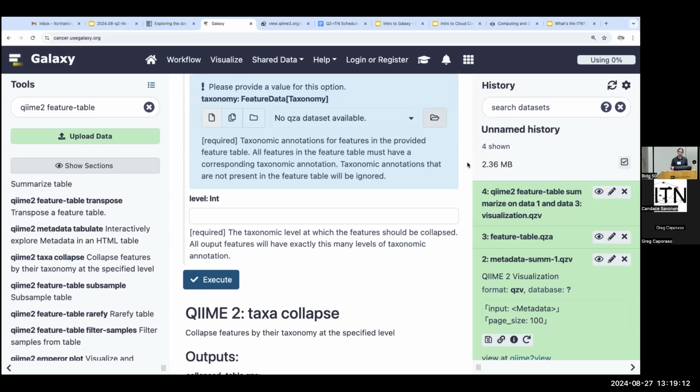For example, this is where we store the data provenance. Any information on how that artifact was generated would be in this unzipped artifact in a directory called provenance.